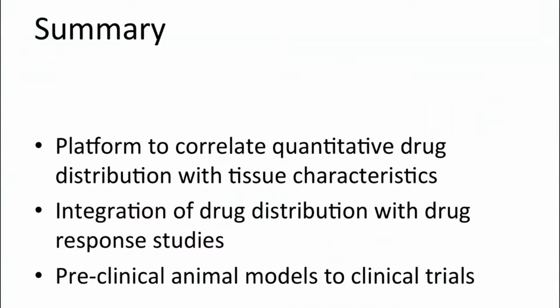So in summary, I've shown you some of the platform that we've developed to correlate quantitative drug distribution with tissue characteristics, and then an integration of drug distribution with drug response studies, and that we can apply those all the way from preclinical animal models to clinical trials.